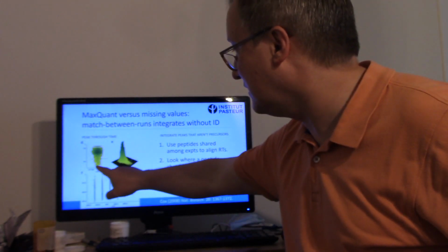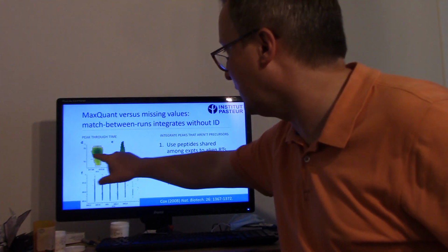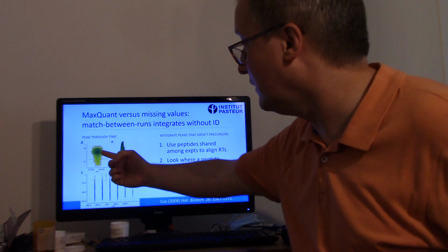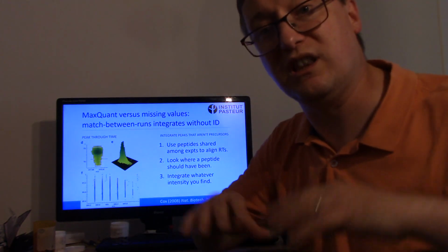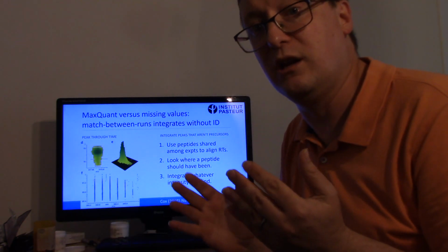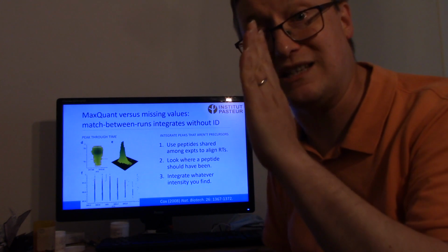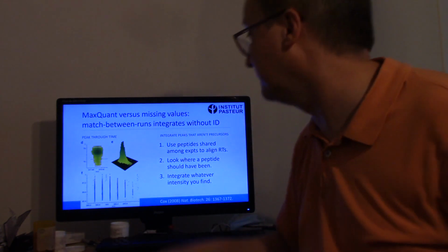And you can see that in each of these time points, each of these horizontal stripes across this figure represents a different time at which an MS scan was collected. And here the color, dark green being the most intense, and these lighter yellows being the less intense, these are telling us about how much intensity is observed for this peak in the original profile mode MS scan, which is to say that we're not just portraying this peak as a stick, we're looking at all of the intensity around it as observed in the mass spec.